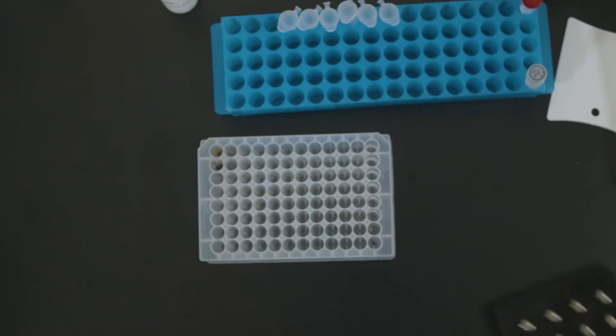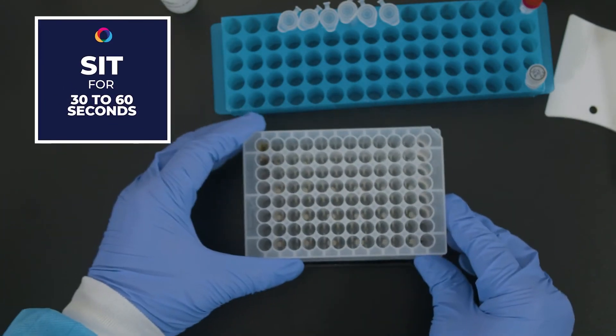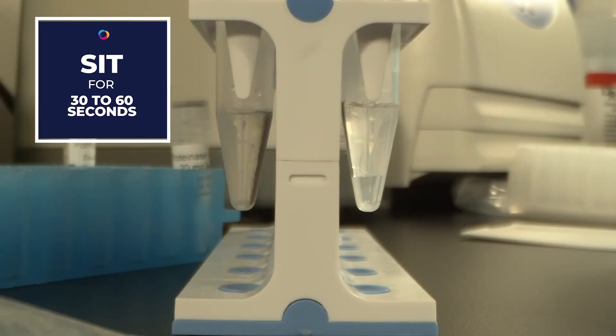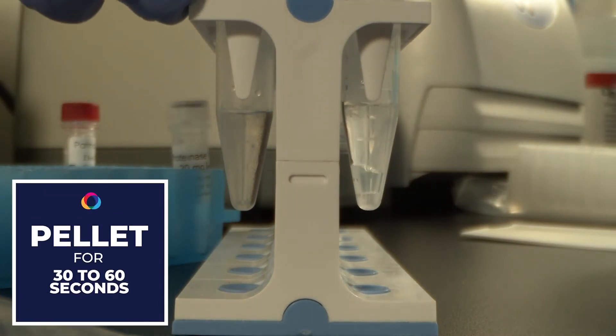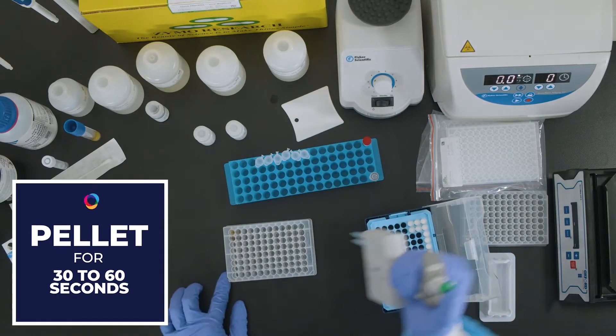Transfer the plate or tubes to a magnetic stand and allow to sit until the beads have pelleted, approximately 30 to 60 seconds. In this example we are using a 1.5 mL tube stand. Place the tubes on the magnetic tube stand and allow to pellet for 30 to 60 seconds. Aspirate and discard the supernatant and retain the pellet.